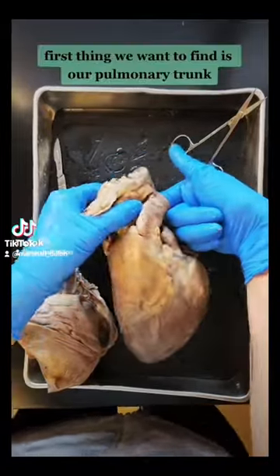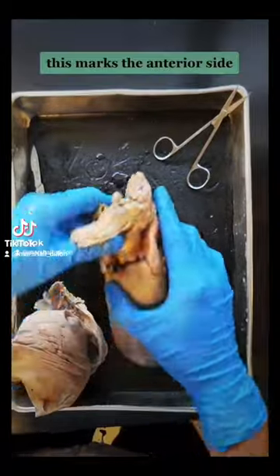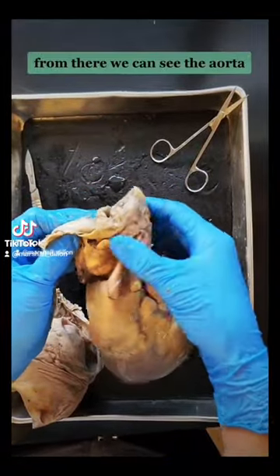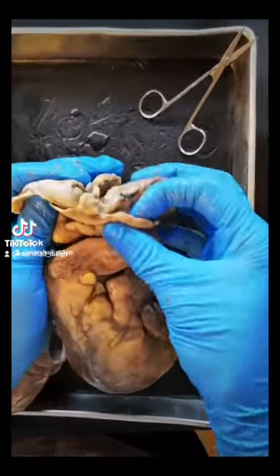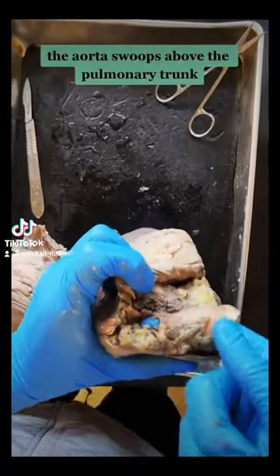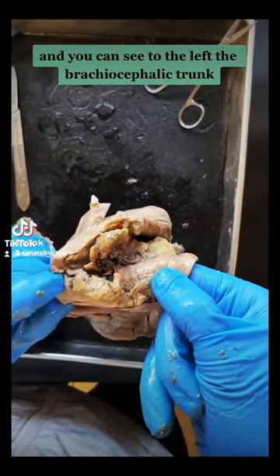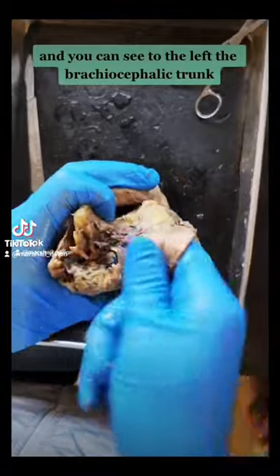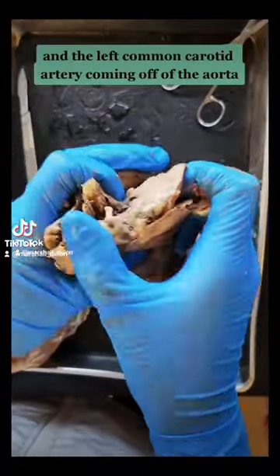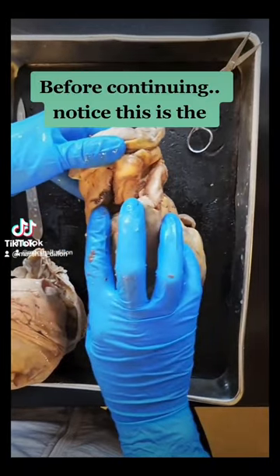First thing we want to find is our pulmonary trunk, which my finger is in right now. This marks the anterior side. From there we can see the aorta. The aorta swoops above the pulmonary trunk and you can see to the left the brachiocephalic trunk and the left common carotid artery coming off of the aorta.